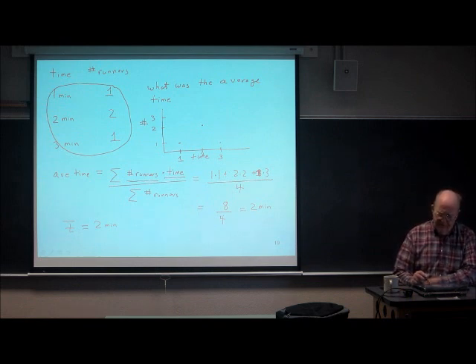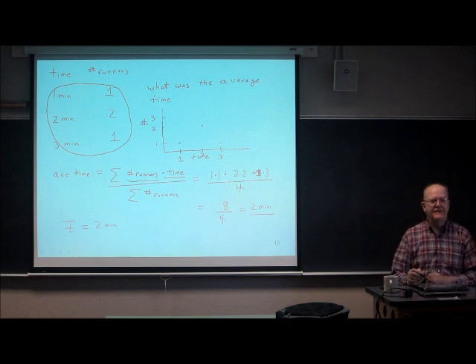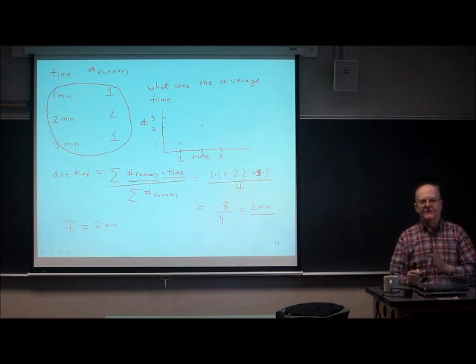1 plus 4 plus 3 is 8. 8 divided by 4 is 2 minutes. That's the average time.